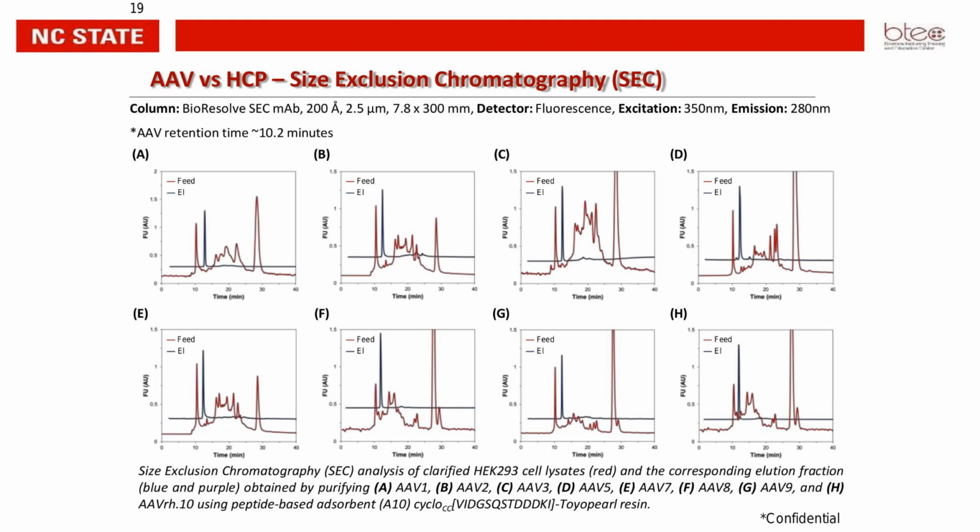We also utilized this method in recent times to quantitate the amount of capsids that are present. You can do this by building standard curves with standard AAVs, and it works very well and has been very comparable to what we see with ELISA as well.